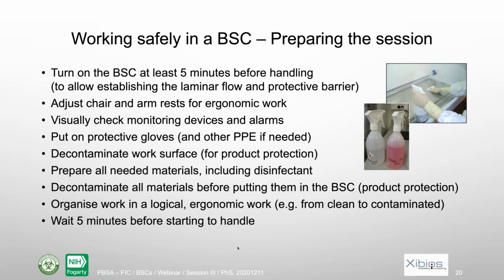So the first thing to do is to turn on the biosafety cabinet at least 5 minutes before handling, and some procedures will say 15 minutes. And that's even before you start putting things inside, because when the biosafety cabinet is working, you are cleaning the air progressively. So it's good to do it from the start.